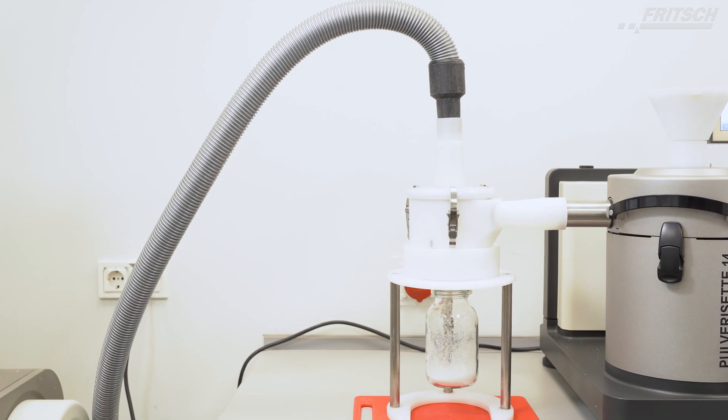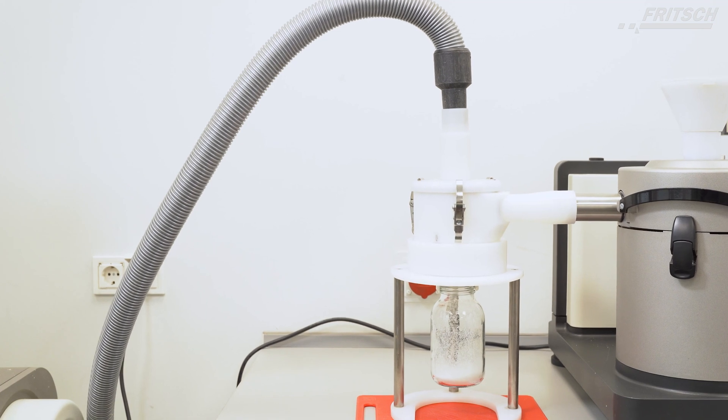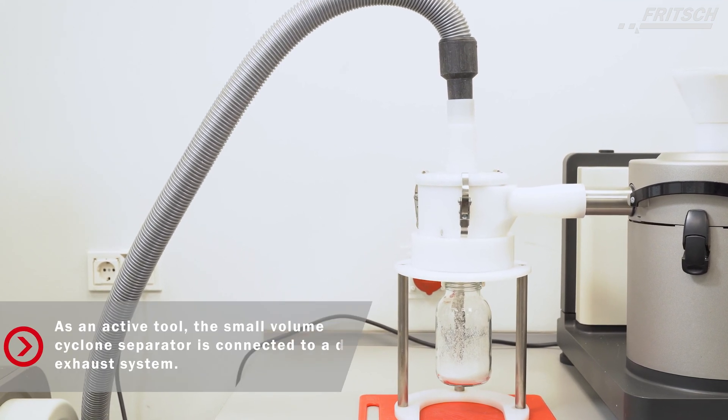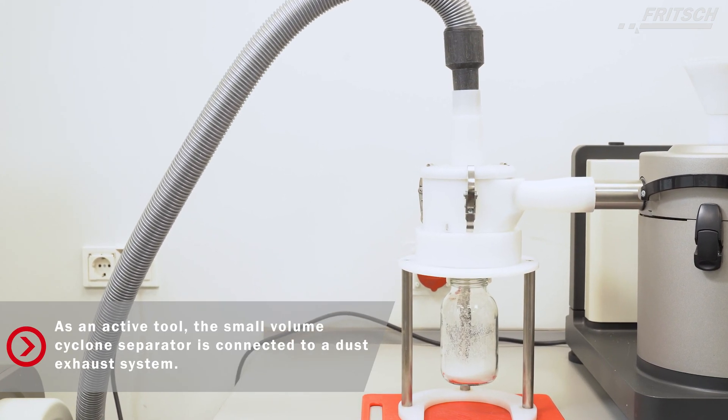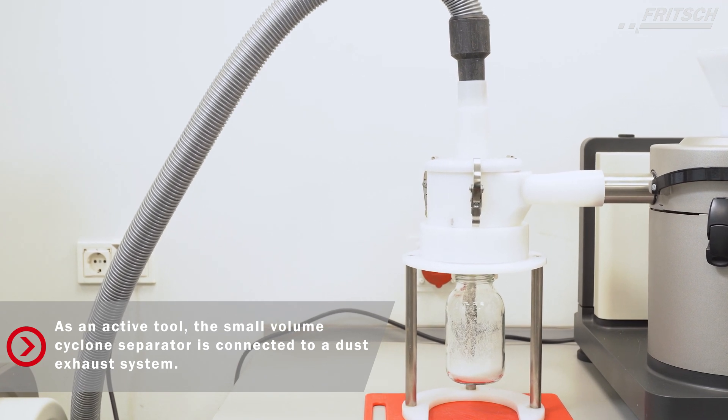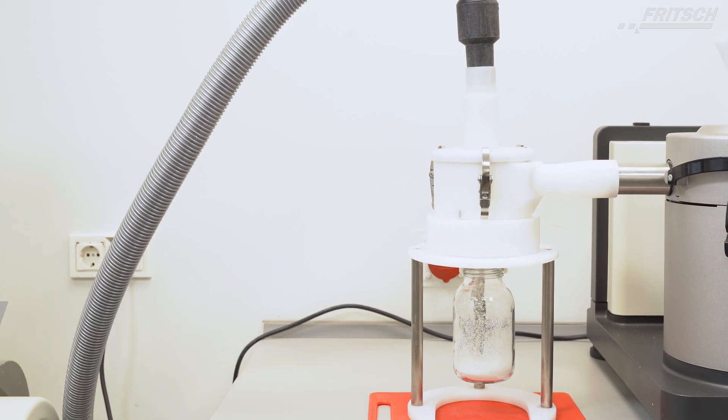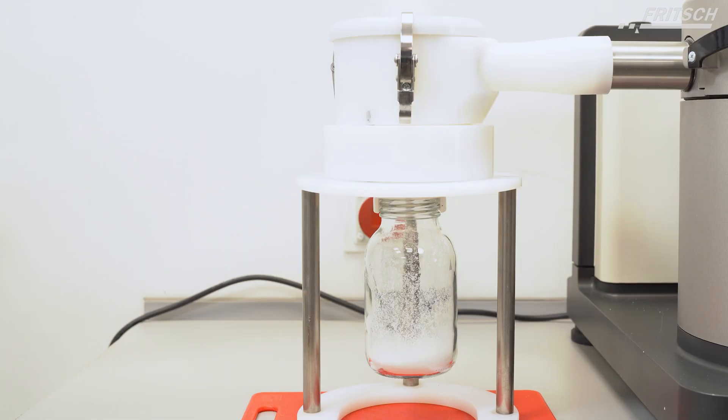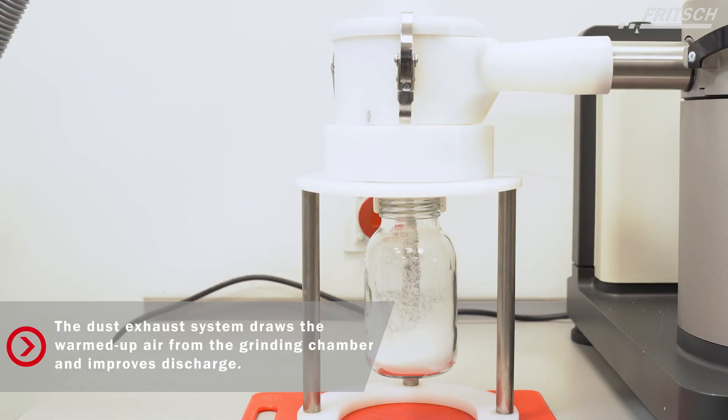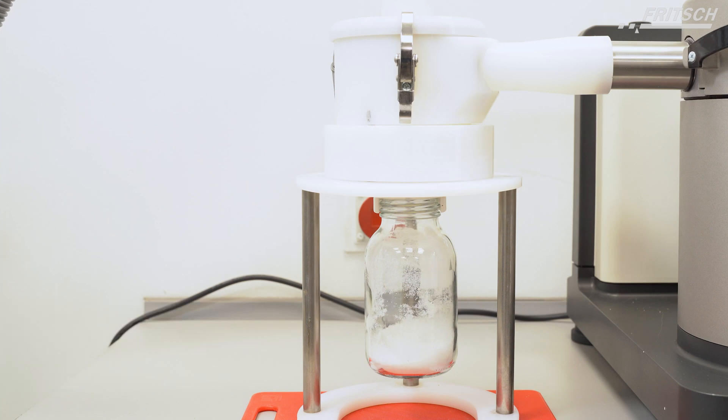For our application we use the small volume cyclone separator as a passive tool. This small volume cyclone separator could also be used as an active tool which is very useful for cleaning the instrument, transporting the particles, and cooling down the sample which is very important for plastic samples.